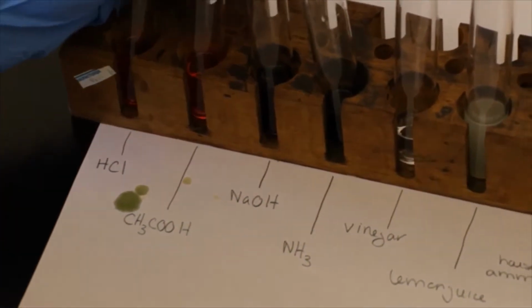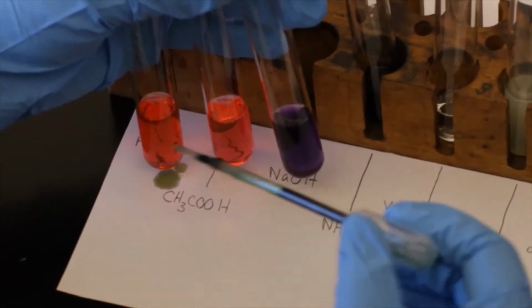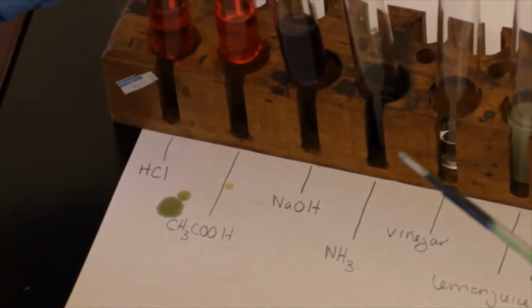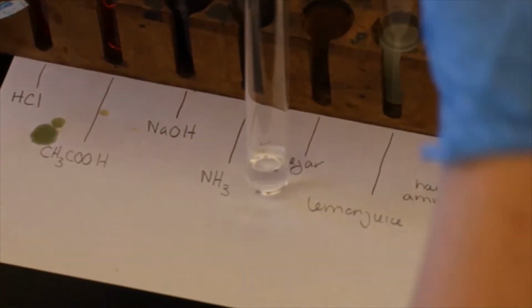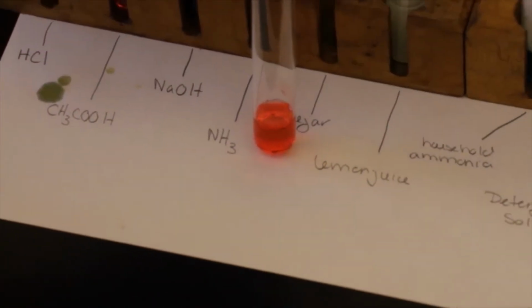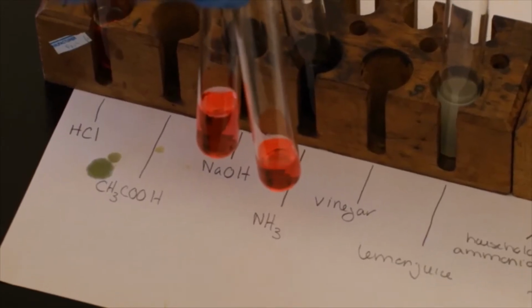So again, if we're just going to review those acids and bases, HCl, then we have our acetic acid, and then our NaOH. So if we're going to go with vinegar, a nice red color, very similar to the acetic acid. Makes sense because vinegar's main component is acetic acid.